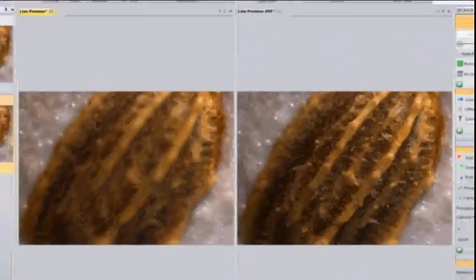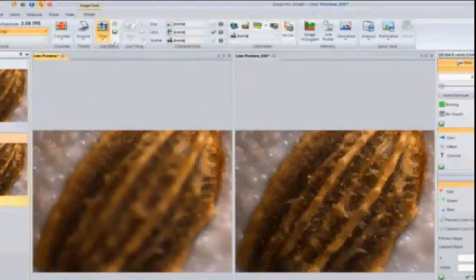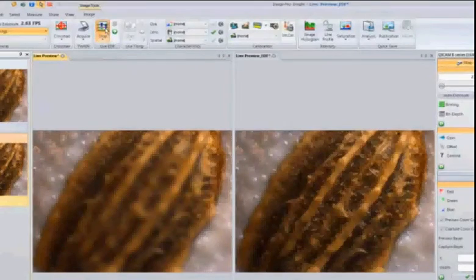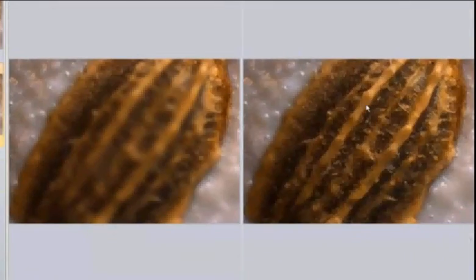I stop the Live EDF, and voila, I have my full extended depth of field image as now an image that can be saved. So that is extended depth of field.